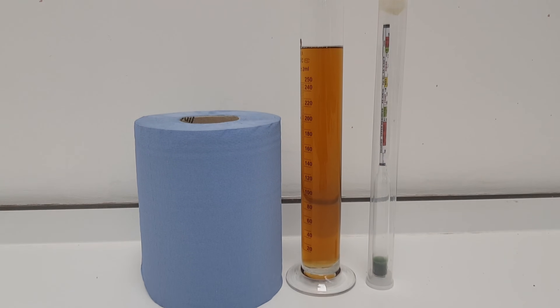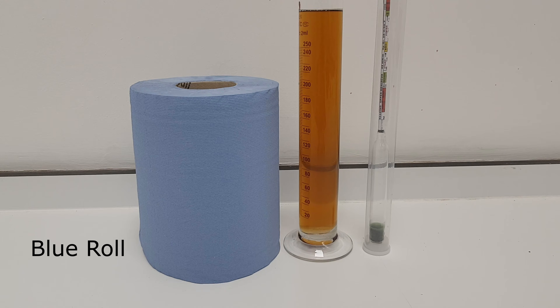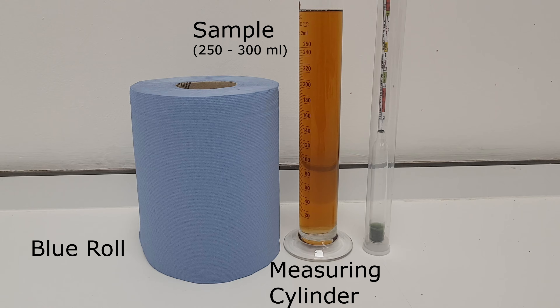To measure the density of your sample, you'll need the following: some blue roll, a transparent measuring cylinder with about 250-300ml of sample, and your hydrometer.